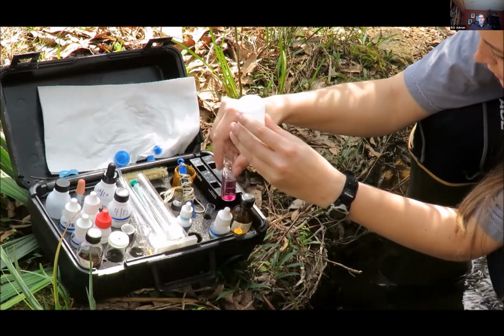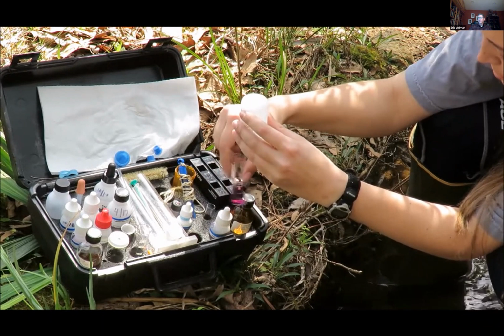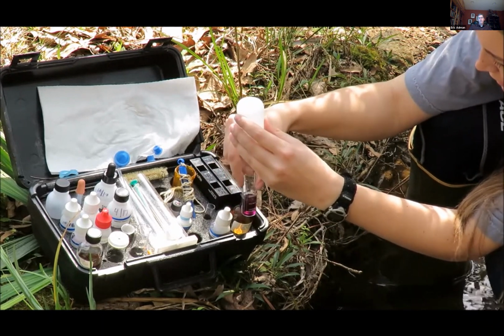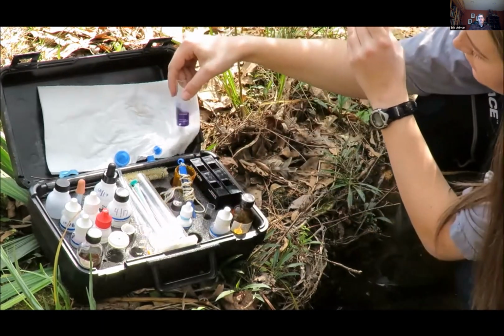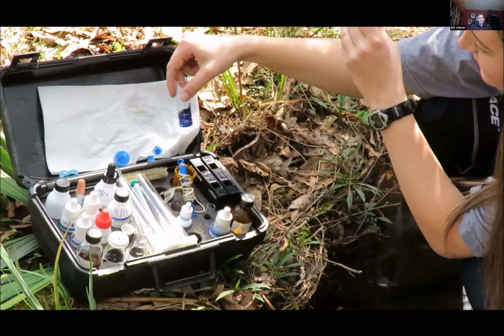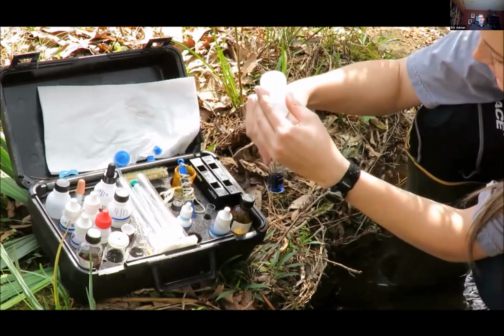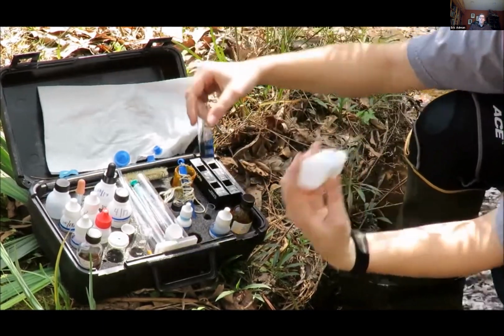Continue adding single drops of the reagent until the pink color changes to blue and eventually no longer changes with any addition. Do not count the last drop if there is no color change after its addition. Multiply the number of drops added by 10 to calculate the hardness value in milligrams per liter.